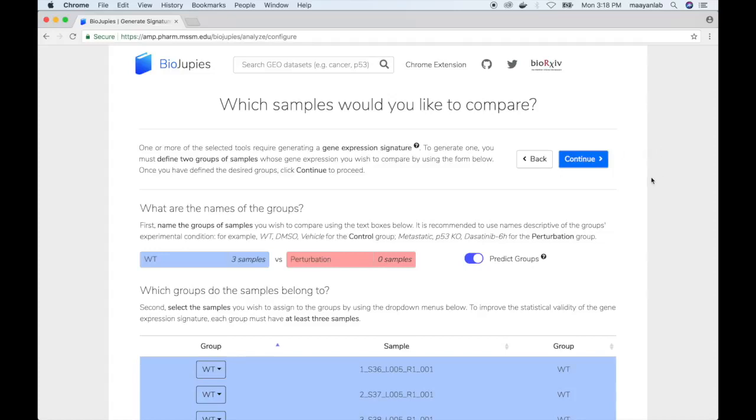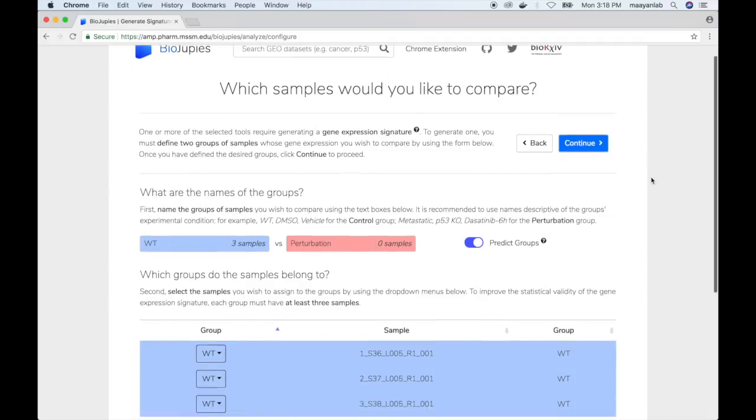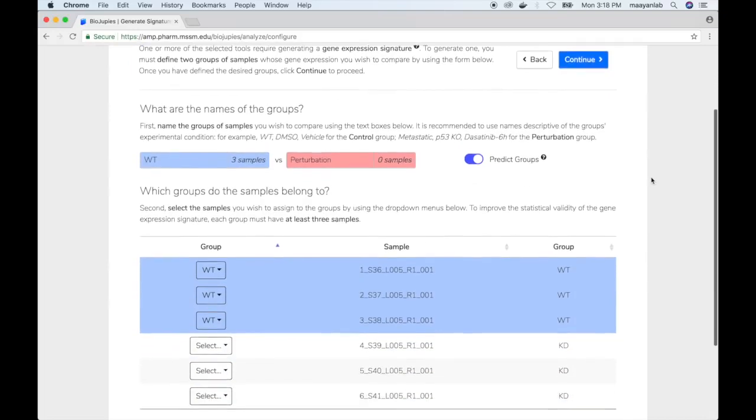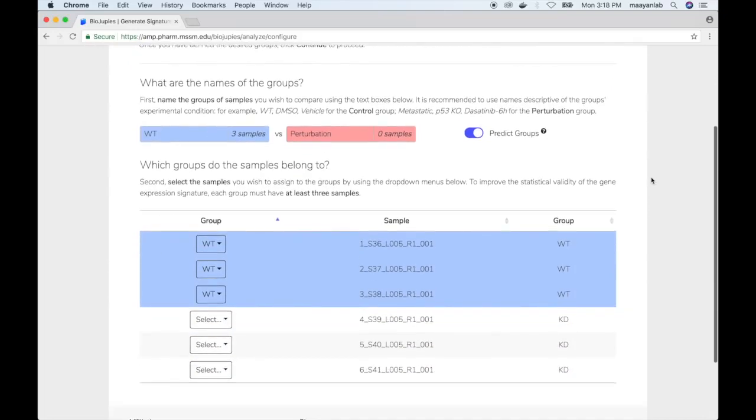The user is required to specify two groups of samples they wish to compare in order to generate a gene expression signature. First, the user is required to specify the names of the groups. We'll compare the wild type group to the knockdown group.